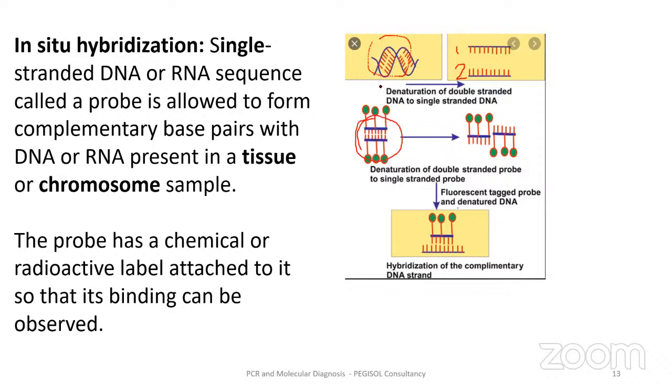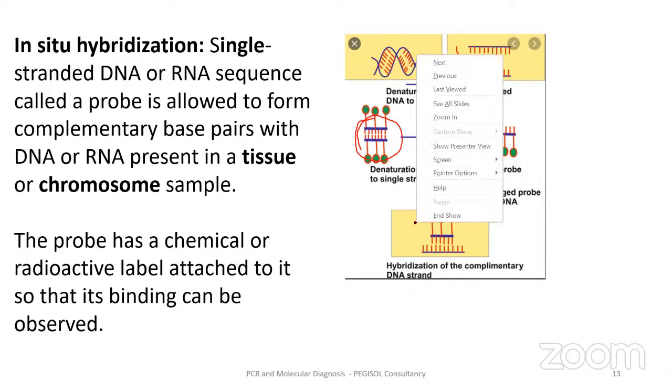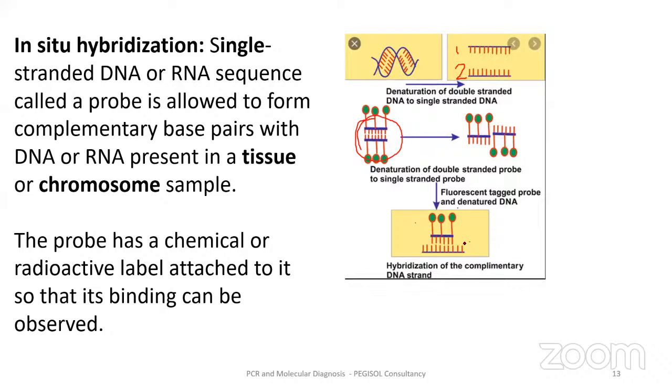The DNA is double-stranded, the probe is double-stranded. When you denature the DNA, it forms into 2 strands. The same thing when you denature this probe, it also forms into 2 different strands. So if this DNA strand here is similar to the sequences found in the commercial probe, it can bind to it. Then if it is not similar, it will not bind to it. So when we have a complementary probe, which you can actually determine ahead of time, when you separate the DNA and then the probe separate, they can now bind together, complementary. The ones that are the same will just bind together.